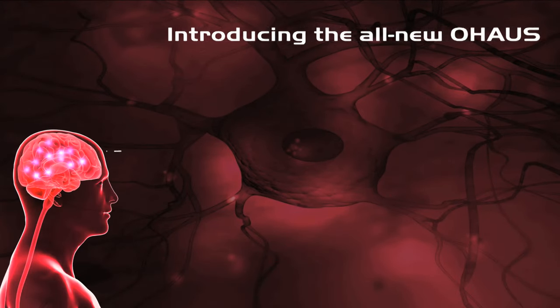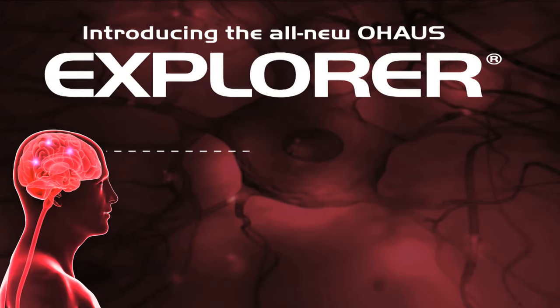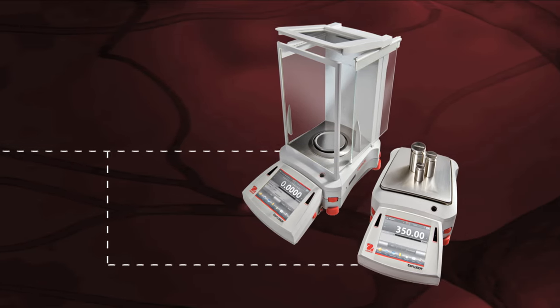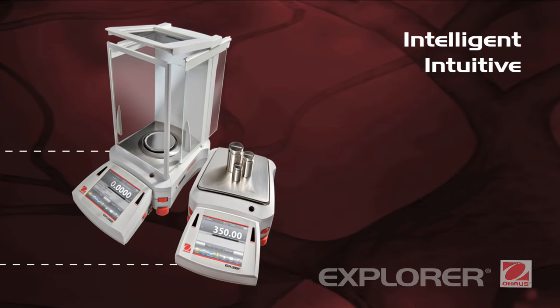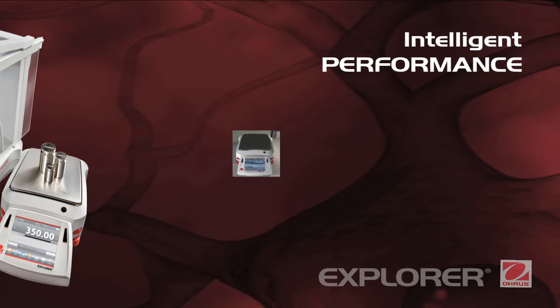Introducing the most intelligent and intuitive balance ever to come from the mind of O-House. The all-new Explorer represents a revolutionary shift in the way you interact and operate a weighing instrument — completely reimagined from the ground up. Intelligent, intuitive, ingeniously practical.